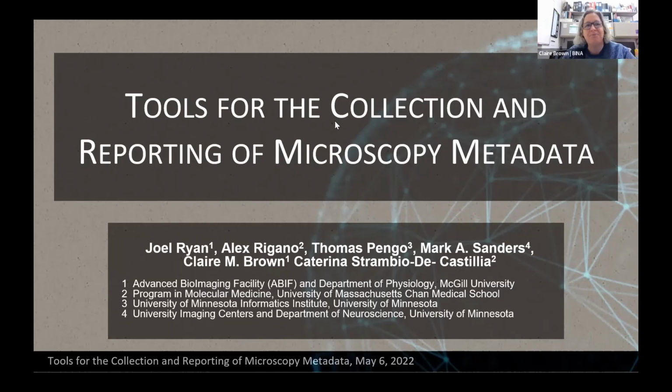And Joel? So hi, my name is Joel Ryan. I'm an imaging scientist working with Claire Brown here at McGill in Montreal. And I guess I was a little bit more involved in MethodsJ2 in this collaboration with Claire, Caterina, Thomas, and many others. So looking forward to chatting about it more today and getting some of your feedback. Thank you.